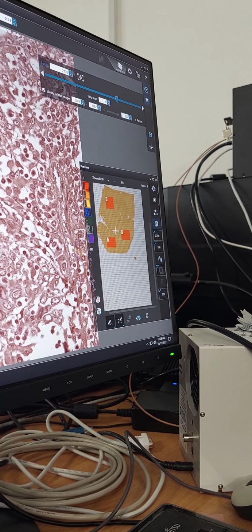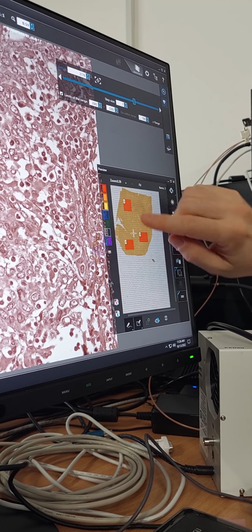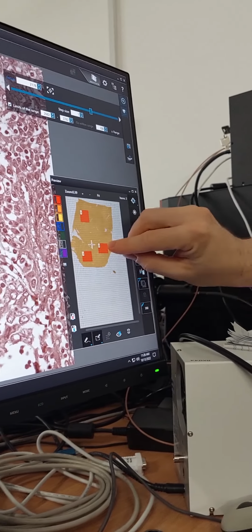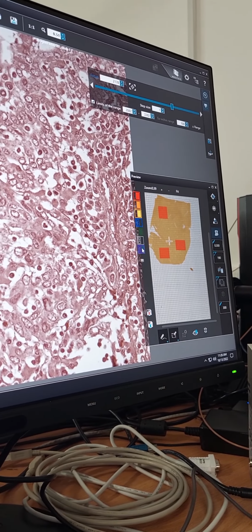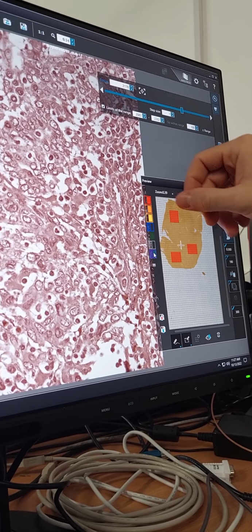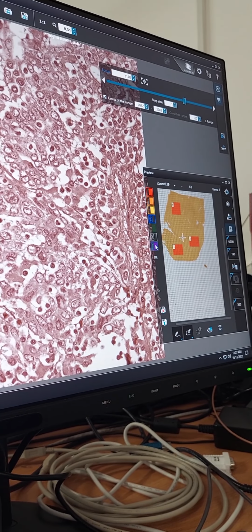So it means if you have chosen autofocus, it is first going to build an autofocus map for this area only, this little square, do the scanning, save it to another file, then do the autofocus map for this one and save it to a separate file. When separate scan is not turned on, the autofocus map is going to be one big focus map for all three, and then these are going to be imaged together in the same file. So this is also a pretty useful function.